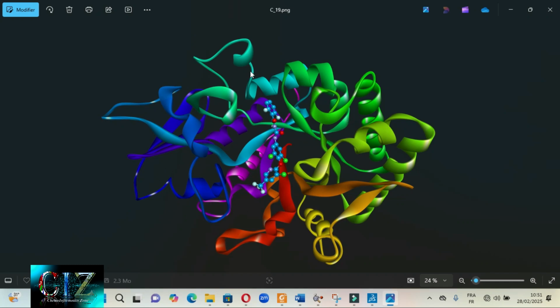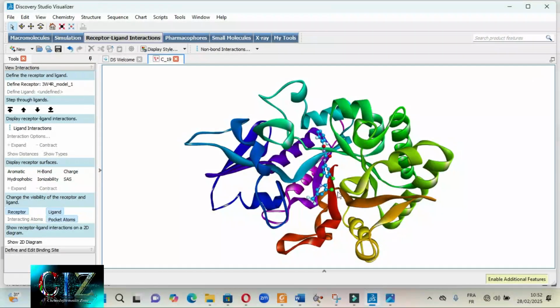As you can see, while you are using a transparent background, you can superpose this image onto something else or another image without any problems. That is one of the specificities of transparent background images, and these kinds of images are also very useful when we want to use them in publications, or to superimpose them on a diagram, a table, or another image in a paper for scientific publication or production.